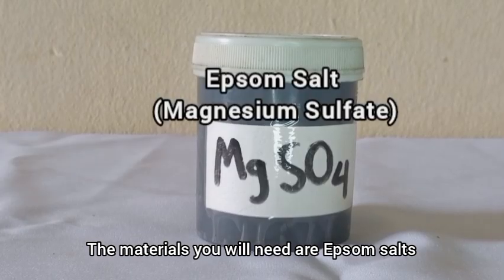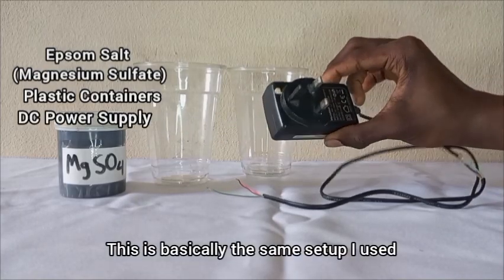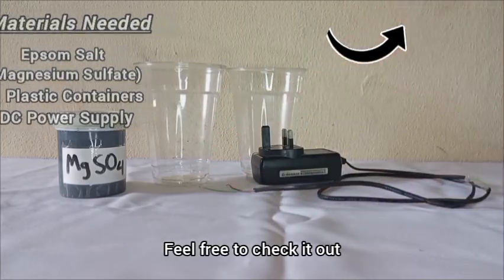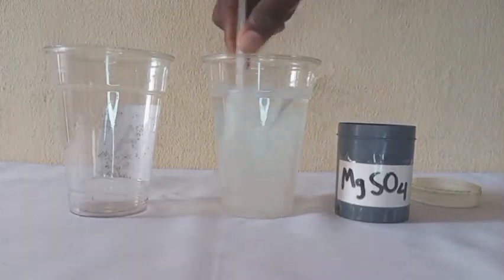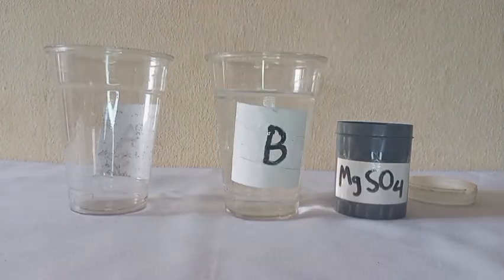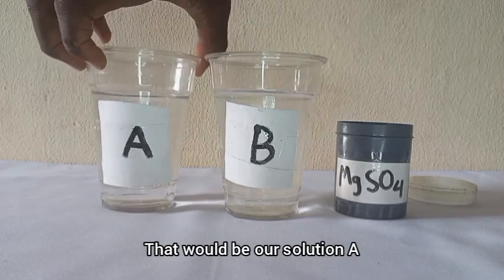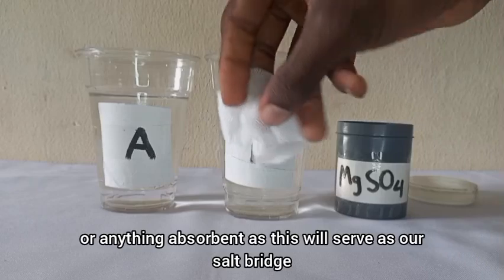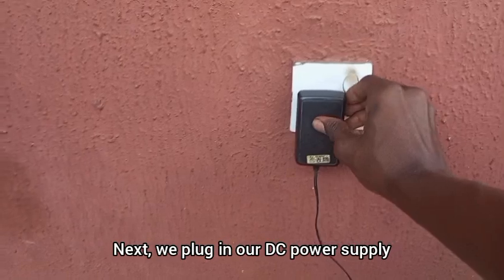For this experiment the materials you will need are Epsom salts, some plastic containers, and a DC power supply — basically the same setup I used when I made sulfuric acid and sodium hydroxide. To start off, we dissolve our magnesium sulfate in water in one container; this will be our solution B. Then we add ordinary distilled water to our other container — that will be our solution A. We also need a piece of cloth or anything absorbent to serve as our salt bridge.